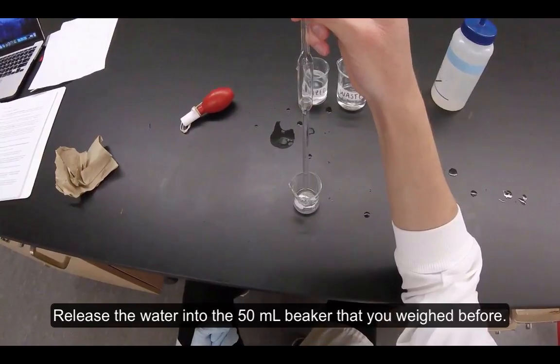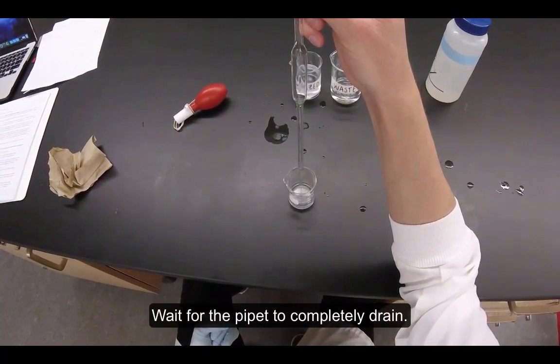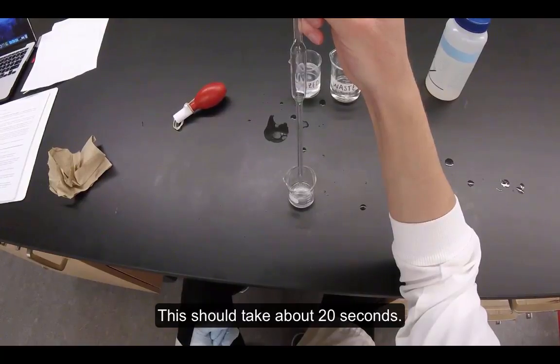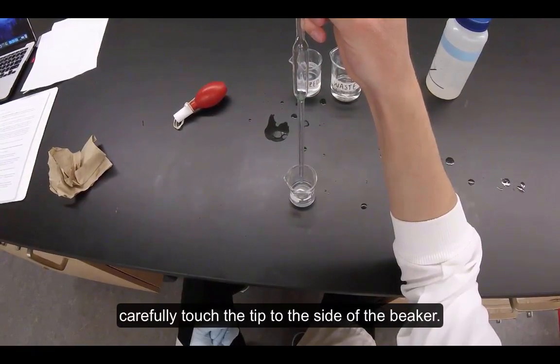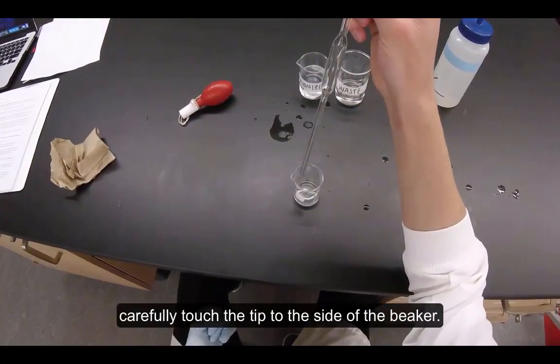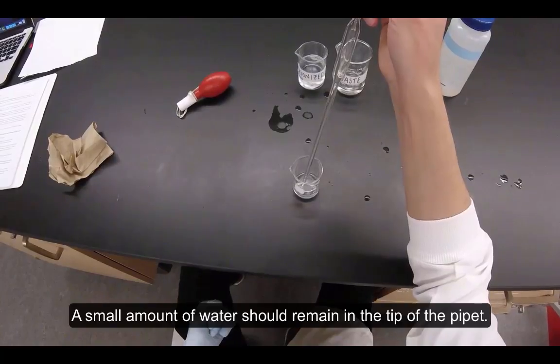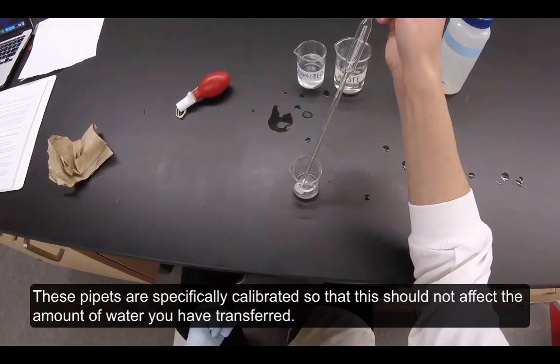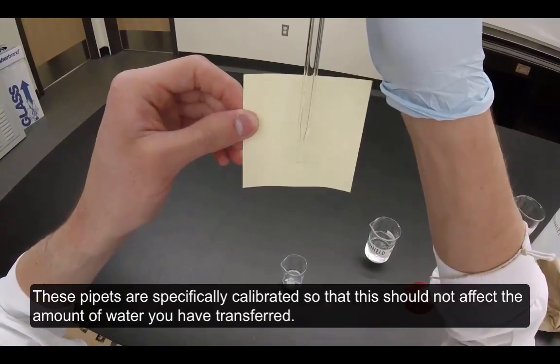Release the water into the 50 milliliter beaker that you weighed before. Wait for the pipette to completely drain. This should take about 20 seconds. After your pipette has completely drained, carefully touch the tip to the side of the beaker. A small amount of water should remain in the tip of the pipette. These pipettes are specifically calibrated so this should not affect the amount of water that you've transferred.